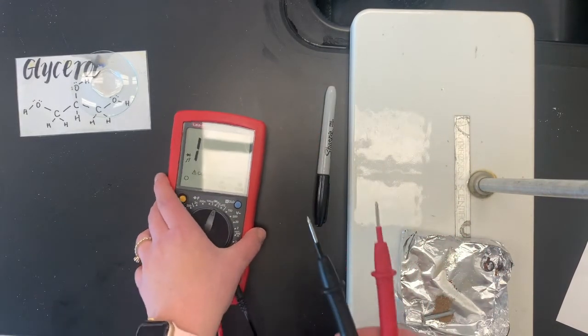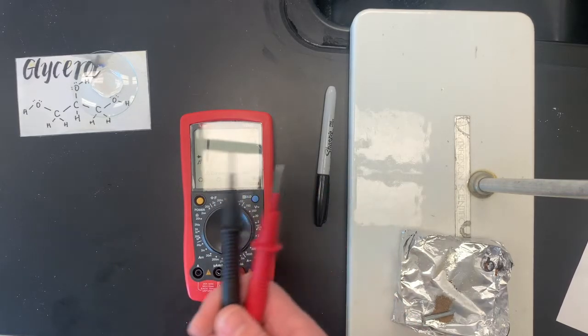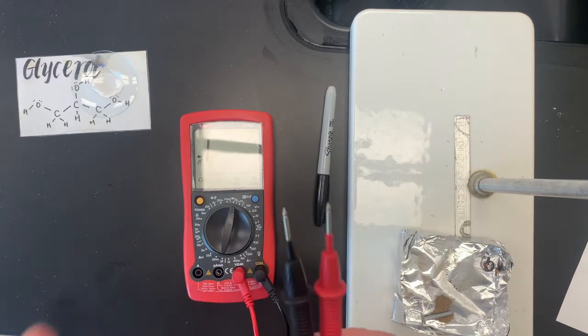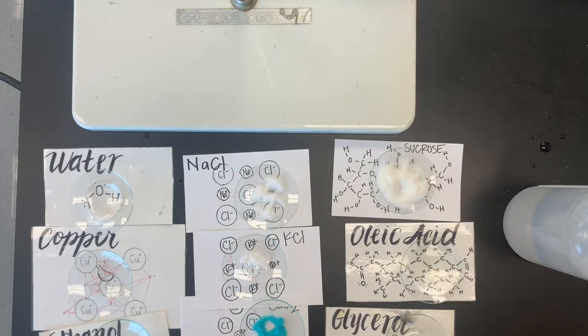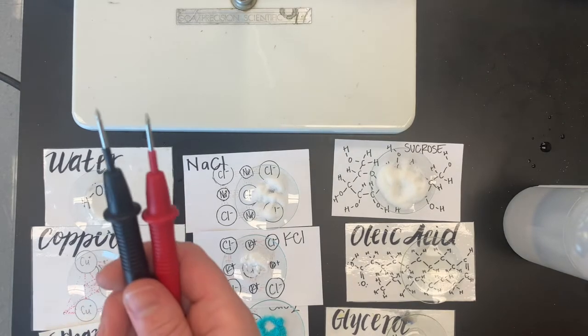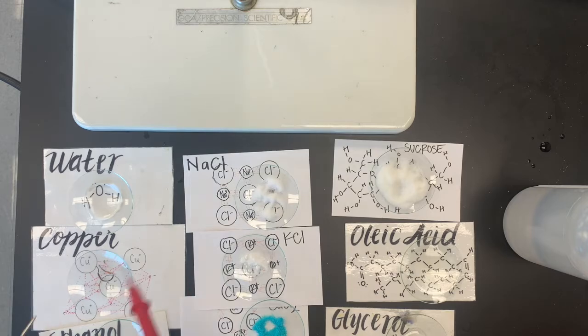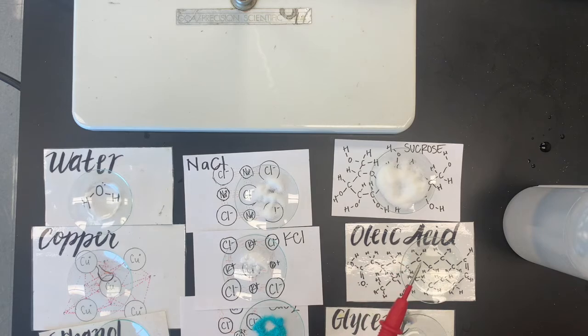So what we're going to do is we're going to be going through and testing lots of these different substances. And I'll be cleaning these off. So it might take a little bit, but so it goes. So I have my two leads, I have a clean rag here that we can wipe these off on to clean between all of these tests. And so what we're going to be doing is just putting these into each of the substances and seeing if they make the tone. So let's just double check, if I put these on the watch glasses, the watch glass does not conduct, I'm not getting a tone.